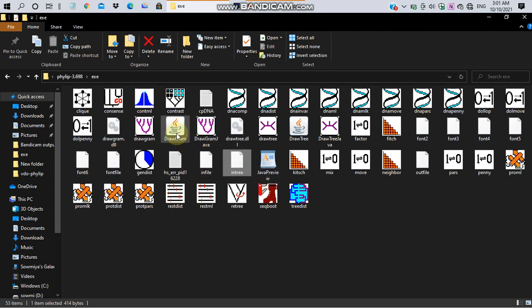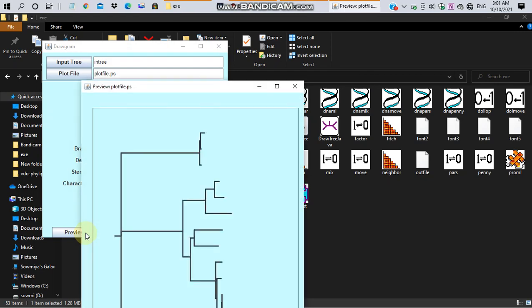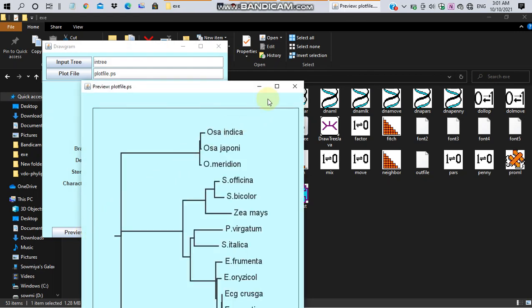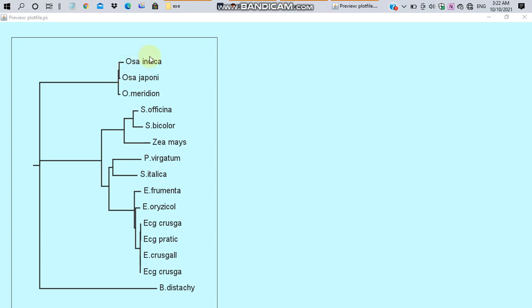For constructing rooted tree, go to drawgram and click on the preview. You will get this tree. In this tree, there are two clusters. In the first cluster, the two cultivated species of rice, Oryza sativa Variety indica and Oryza sativa Variety japonica, are diverged from the same ancestor. That is the chloroplast genome of both cultivated species of rice are evolved from the same common ancestor. Both the cultivated species and the wild species Oryza meridionalis share a common ancestor.